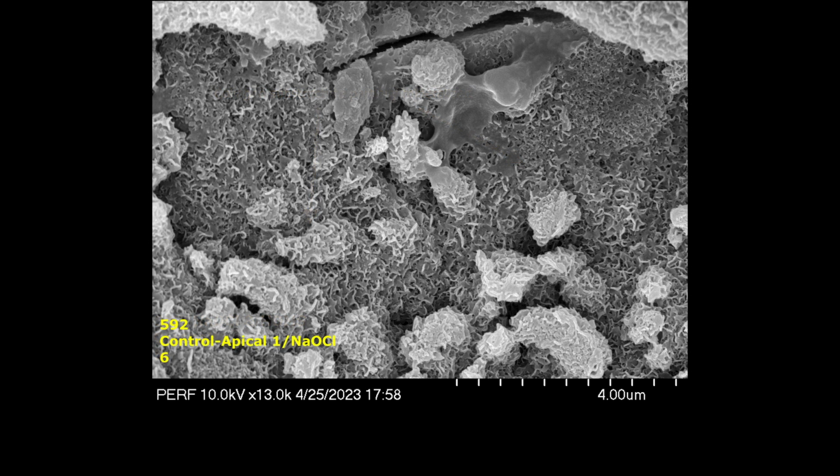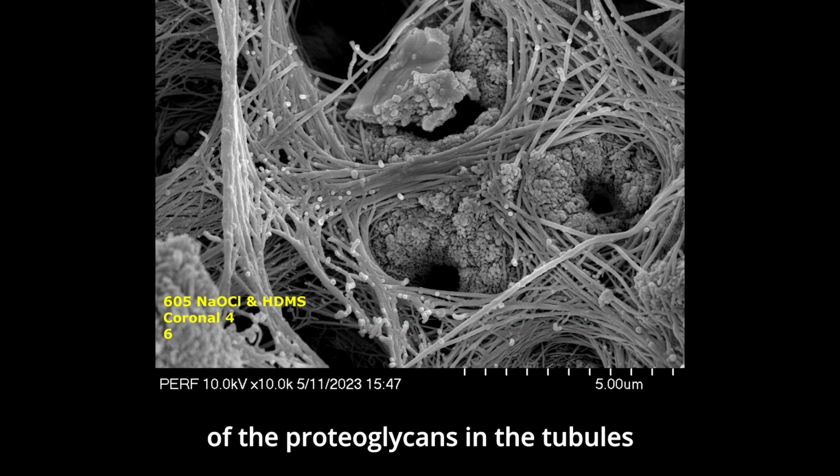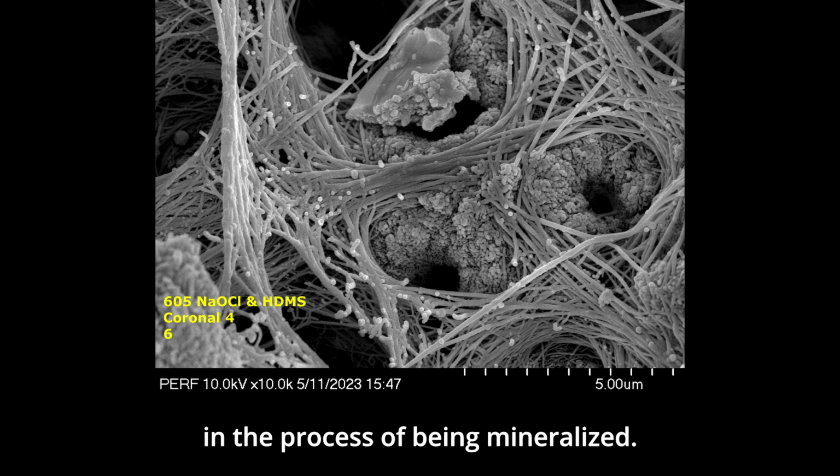And here you can see the collagen fibrils, the starting mineralization, as well as some of the substructure of the proteoglycans in the tubules in the process of being mineralized. This is part of the mineralizing front.